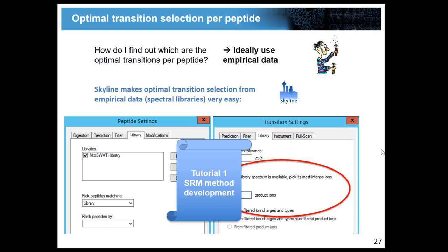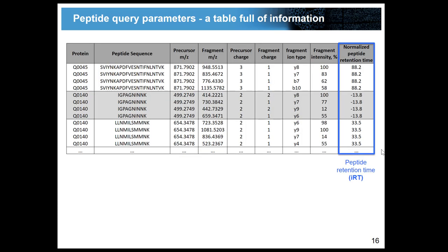Okay, so we're almost done with this third part. The last part is just the normalized retention time information, and this I told you already.